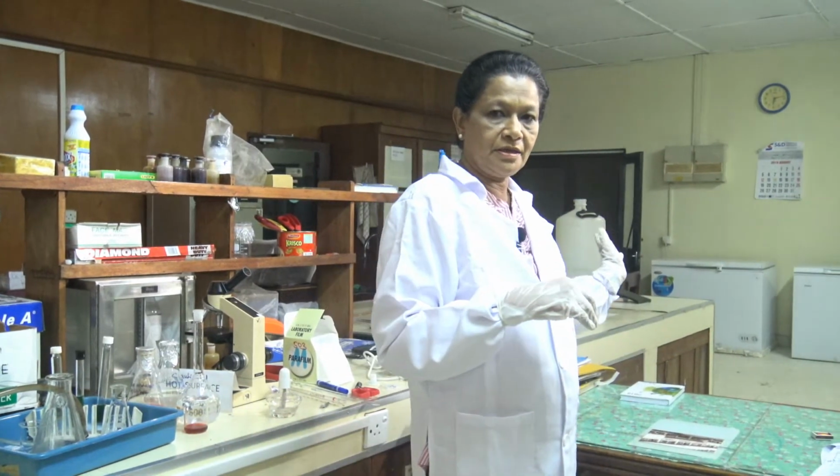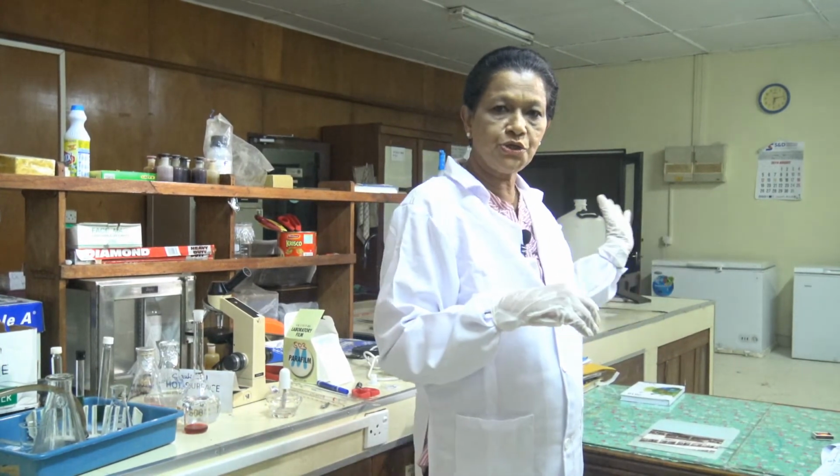When you enter the laboratory, you need to bring only the essentials you need to work, like pens, pencils or pencil case. Keep your belongings outside the laboratory so that your belongings will not get contaminated. And also, before entering the lab, long hair should be tied back and hanging jewelries should be removed.